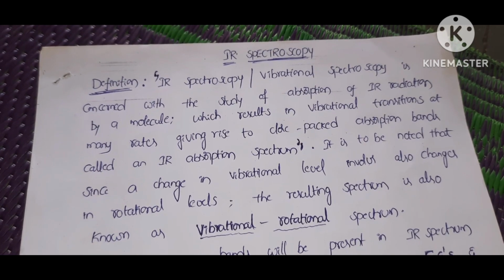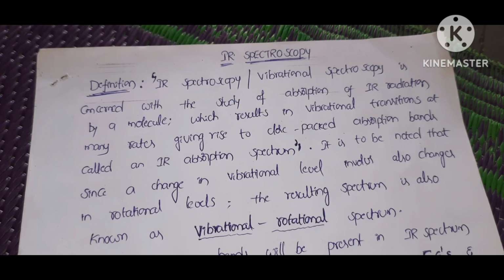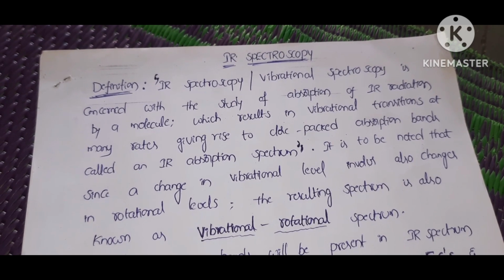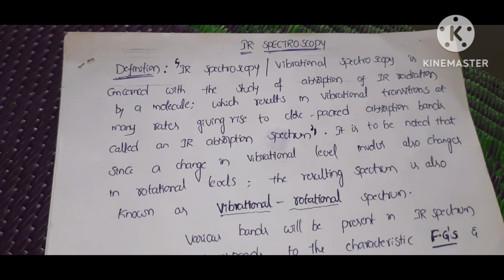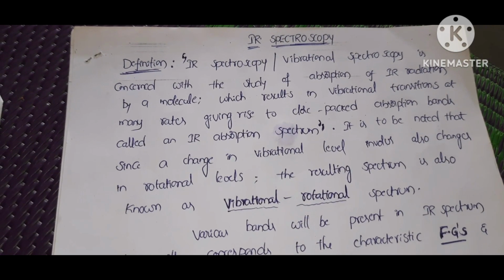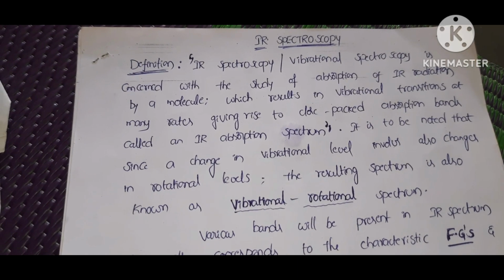For understanding the structure of unknown chemical compounds, we have different techniques like NMR spectroscopy, mass spectroscopy, and X-ray crystallography. IR spectroscopy gives an idea about the functional groups in association with the main compound or the target molecule. We already know that IR spectroscopy is also known as vibrational spectroscopy. Why? Because it involves the vibrations in the compound that is going to be analyzed.